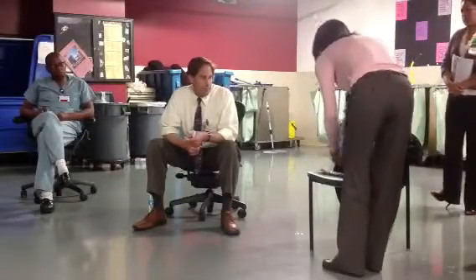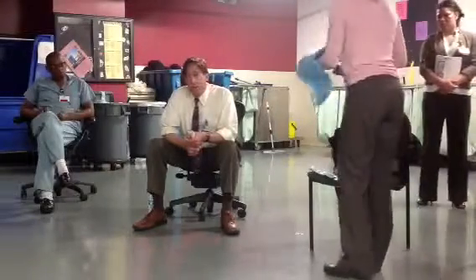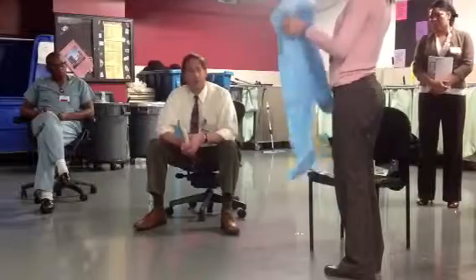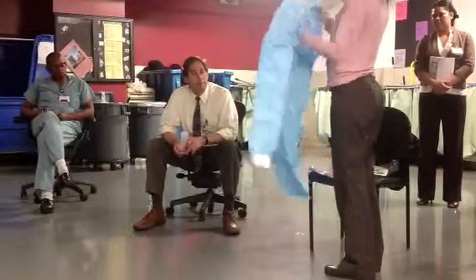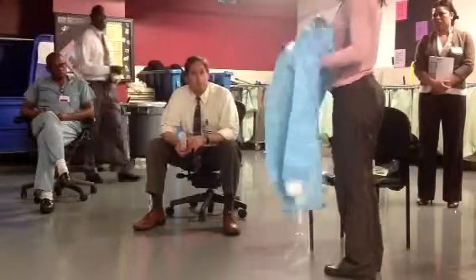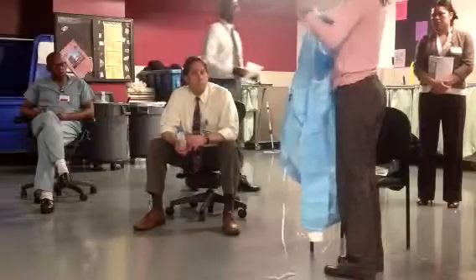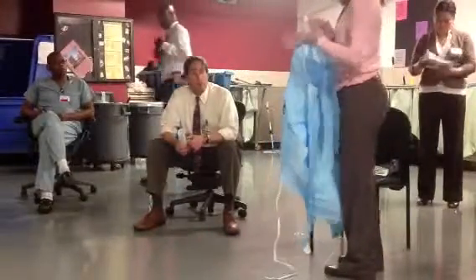So make sure you take your time. This is where you can really take your time, make sure you're doing the right plan, what you're going to do. It will be best if you also have an assistant with you so that you don't do it all by yourself, because you might not want to be the person who goes back and forth. It will be nice to have someone outside the room to assist you in passing any items if you need it.